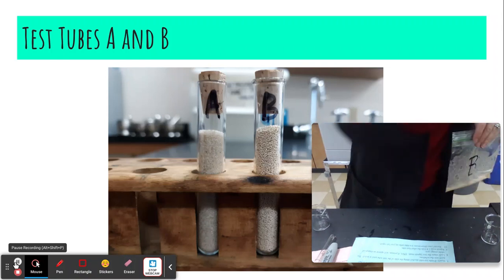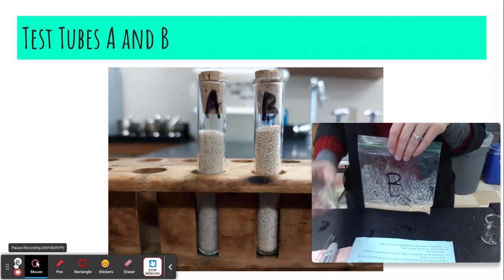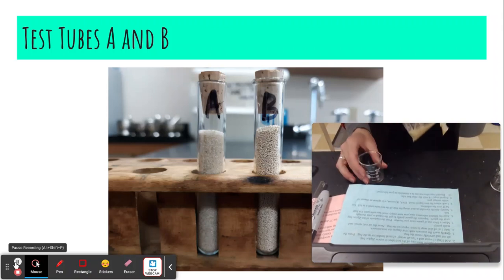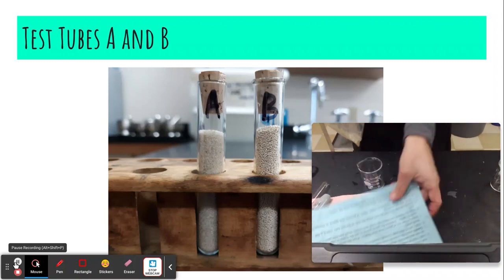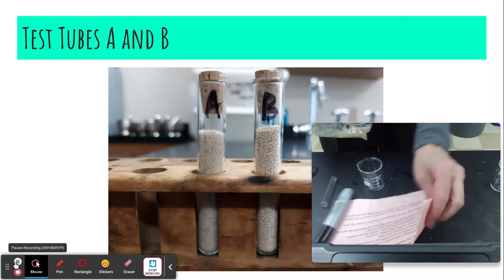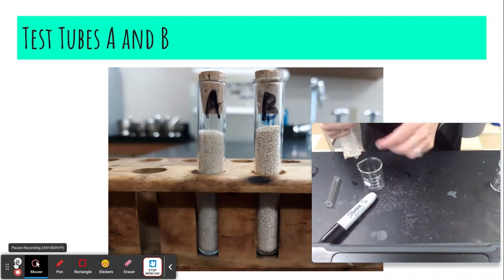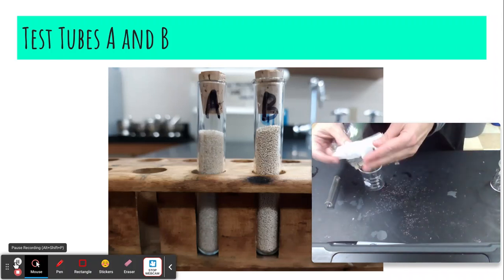So let's start with A. I'm going to go ahead. Here's my beaker. I'm going to see if I can lower my camera enough. I hope you can see this. Get my papers maybe out of the way here. Okay, and I'm going to make a filter out of gauze. So here's my beaker. Here's my filter.